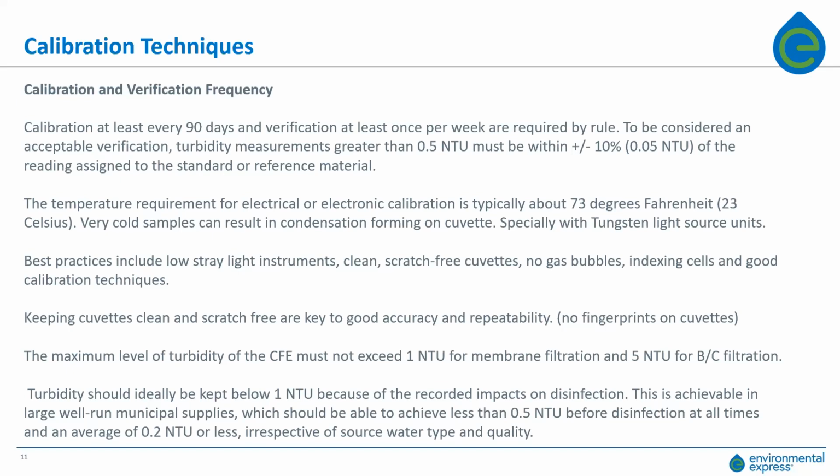I always recommend our customers keep a package of spare cuvettes on hand. Some folks like to use the silicone oil, for example. That fills the impurities in a glass cuvette. But it's been my experience that that silicone oil, if it's not properly wiped off, can also collect dust and other fines that might be floating in the air. So keeping the glass cuvettes clean and scratch-free is a key to good accuracy and repeatability.